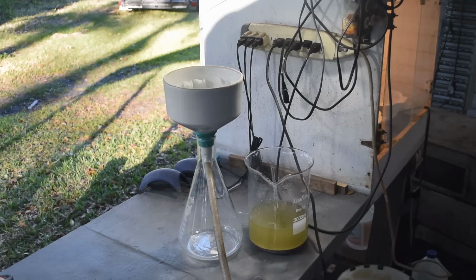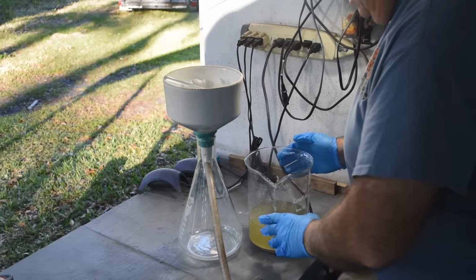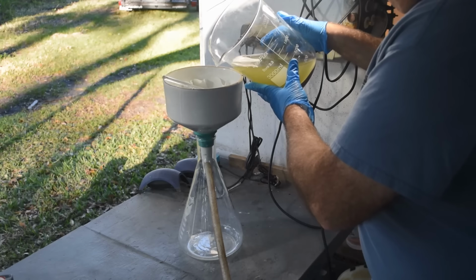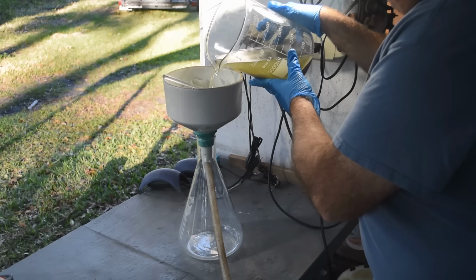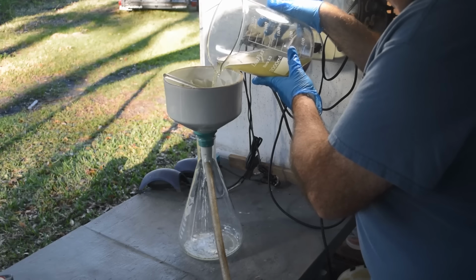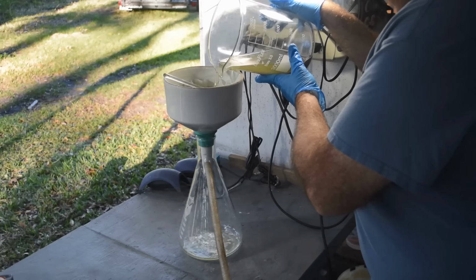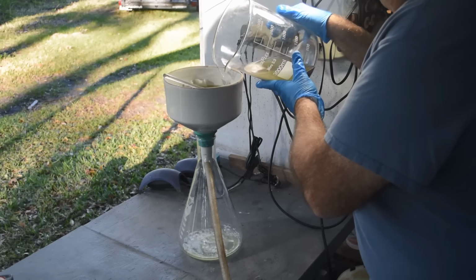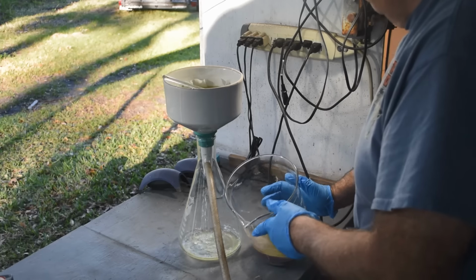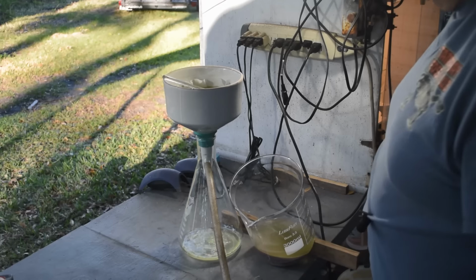All right, let's get this stuff filtered so that we can drop the gold out of it later. The ice is melted. Nice and cool and dilute. So as per usual, I am going to try and get the liquid through before the filter is clogged. And then I will dump the solids in and rinse them with lots of distilled water to get the pregnant solution out of them.